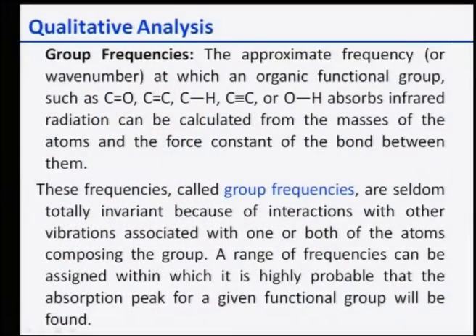So once you know the group presence, we can actually calculate that. This frequency is called group frequencies because they are seldom totally invariant, because of the interaction with the other vibration associated with one or both of the atoms composing the group. A range of frequencies can then be assigned within which it is highly probable that the absorption peaks of a given functional group will appear. That's the idea.